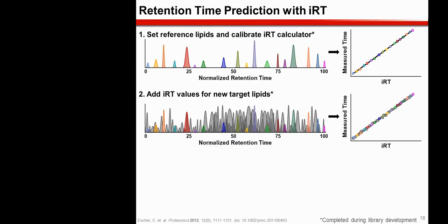And Skyline recently added the option to use, in addition to linear regressions, either logarithmic or loess regressions to set the iRT values. We've found that using a loess regression has worked pretty well for us when we are looking at data from LC methods that have different gradient times, because linear regressions just don't always capture the differences where some gradient regions may be more compressed than others when you lower that time.